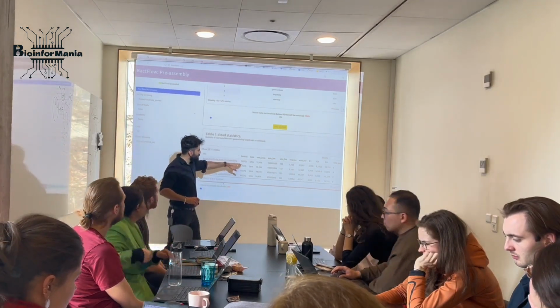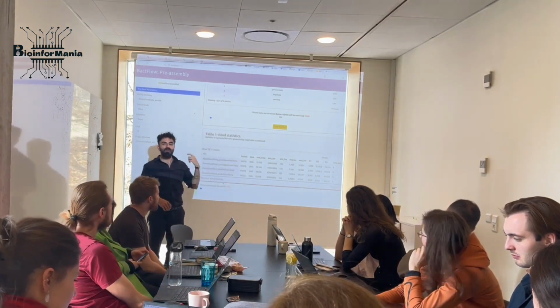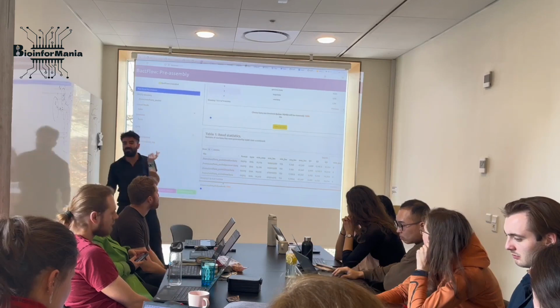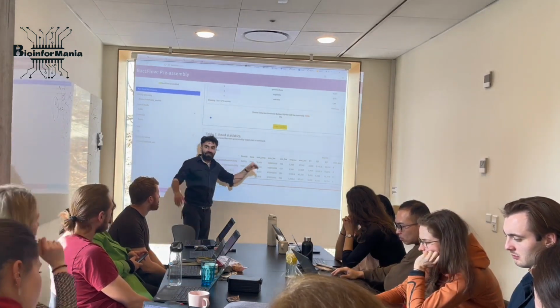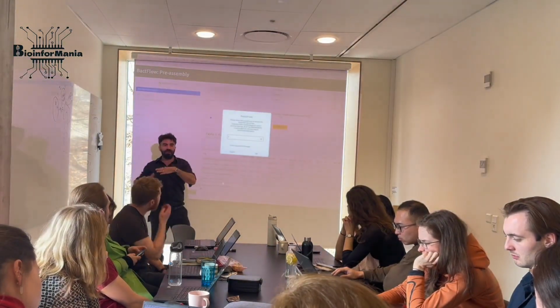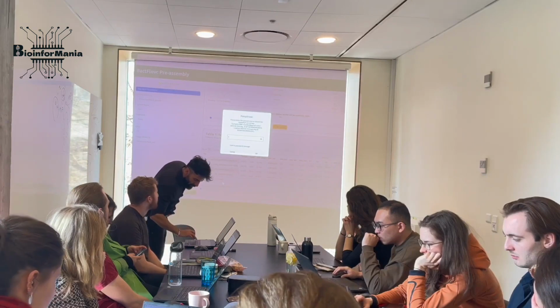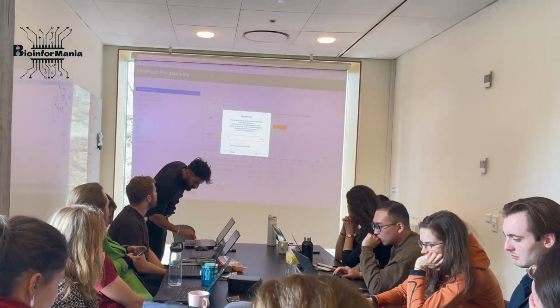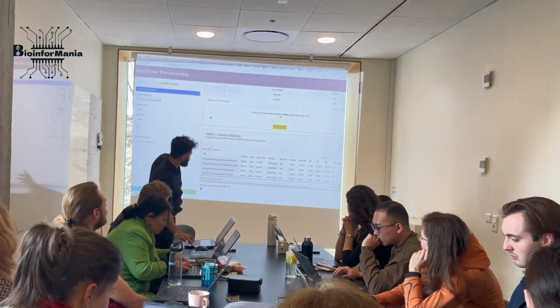So you have the fastq of DNA. You have 15,000 sequences. Those sequences, you remember I talked about the shredded pieces of DNA. Those are the ones. And then eventually they need to be assembled, put together, aligned to create the consensus, and then the scaffold of your genome. Cool. And then you could also take a look at the sum of the length.